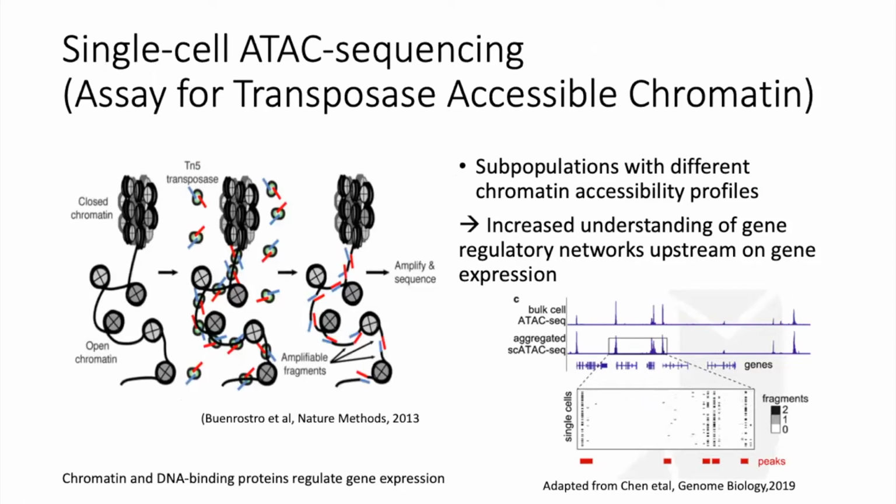The course, as I understood it, is mostly for single-cell RNA sequencing analysis. But there are a lot of other applications that are becoming more common in the single-cell field. And one of them is single-cell ATAC sequencing. So basically, that's an assay for looking at accessible chromatin.